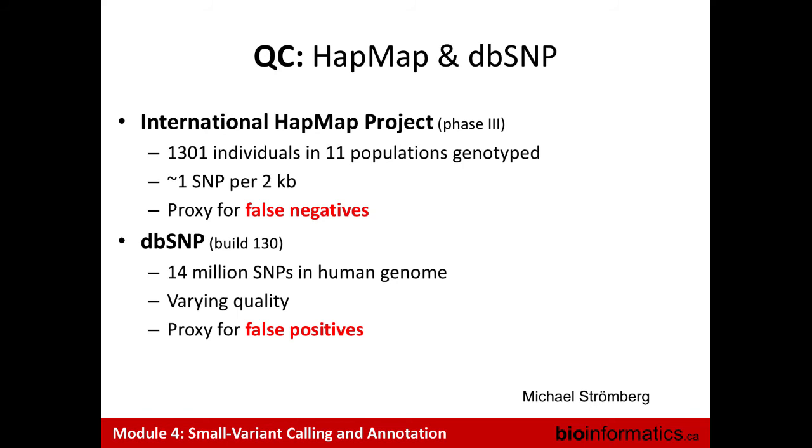dbSNP is really outdated. It's version 148, I think, now. And you have millions of SNPs. So here it's more to detect false positives.